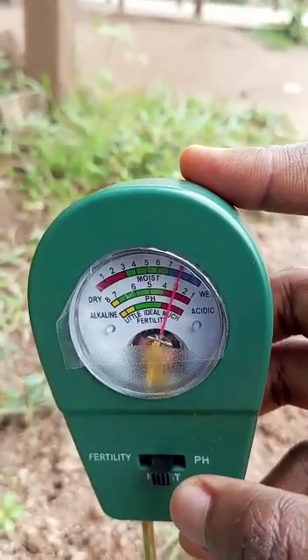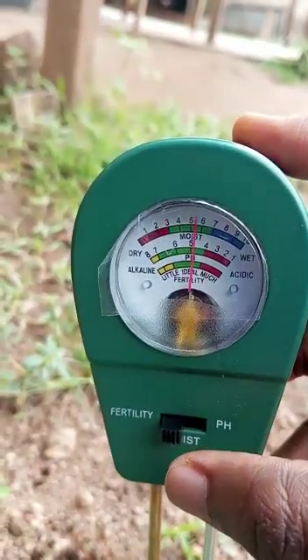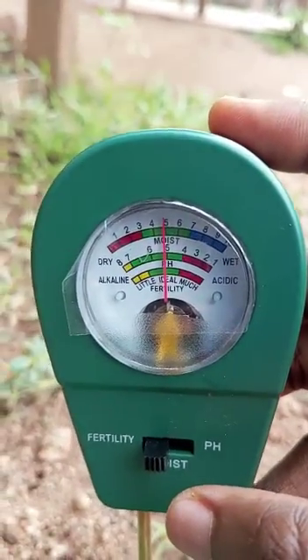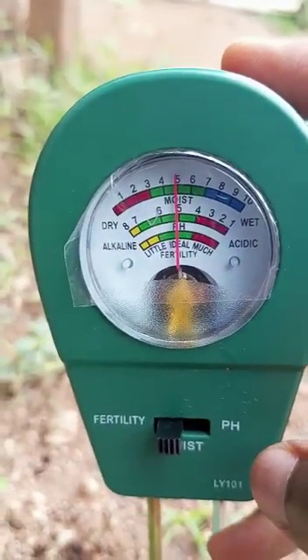We're going to check for the fertility level last. Just switch between the mode. And you can see here that it is ideal — meaning that we have nutrients available for plants here.